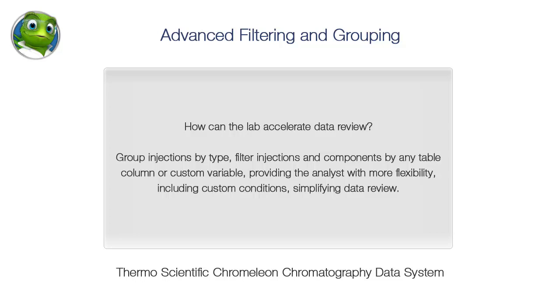How can the lab accelerate data review? Group injections by type, filter injections and components by any table column or custom variable, providing the analyst with more flexibility, including custom conditions, simplifying data review.